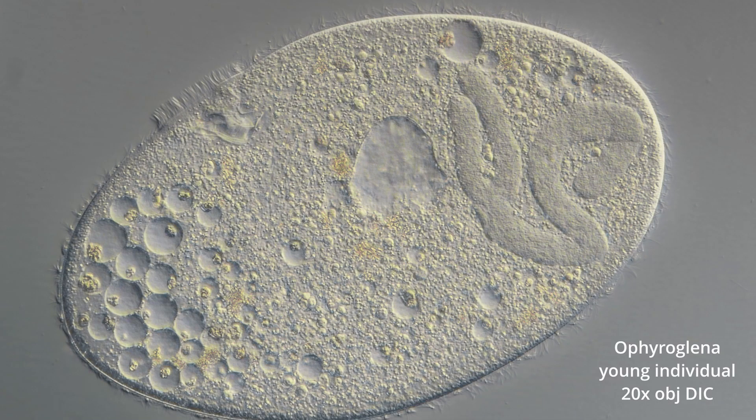I always get great flash pictures when the cover glass starts to press in on the protozoa and flatten it out. Here's an incredible macronucleus, which I've shown here with the arrow. You can see the mouth part here. You can see that it has a much higher density of cilia adjacent to the mouth part, presumably to help bring the food into that area.